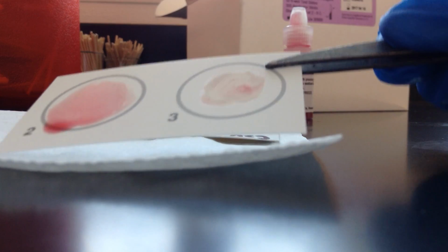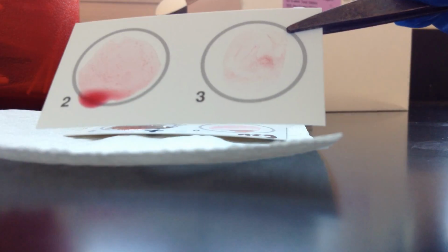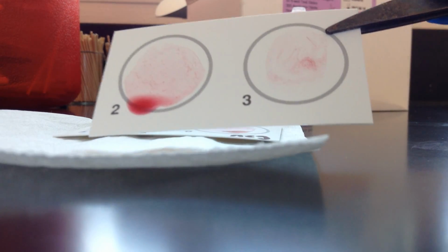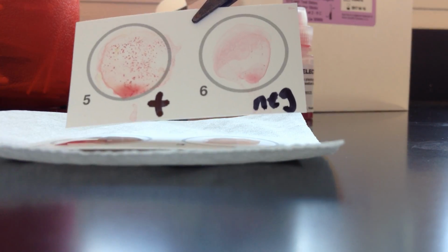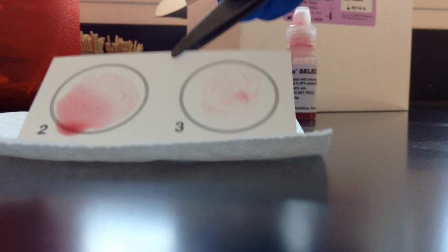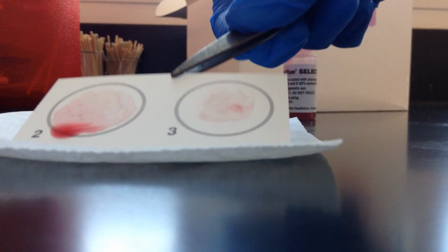So here we're going to pick that up, and you're starting to see that clumping form under the number 2 circle. And again, after a little bit more time, it'll be a little more distinctive like the one I showed you. But you're starting to see that on the 2 circle form as well. Okay, and that is the coagulase test.